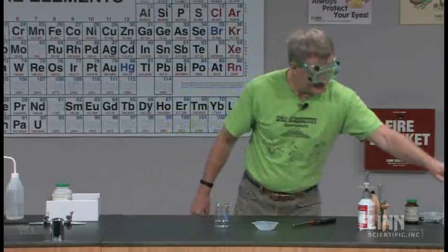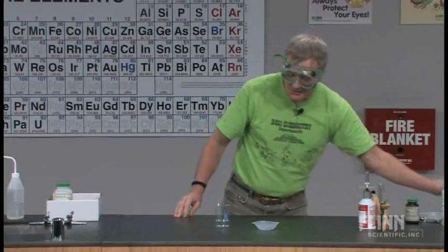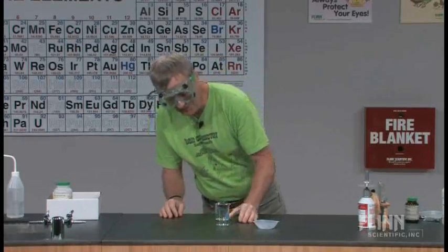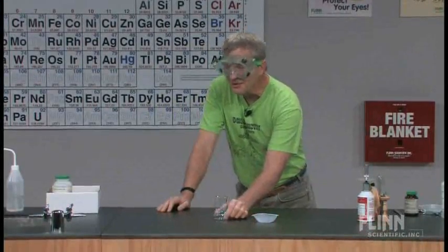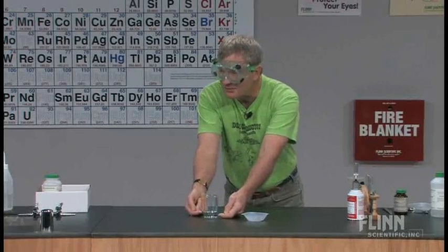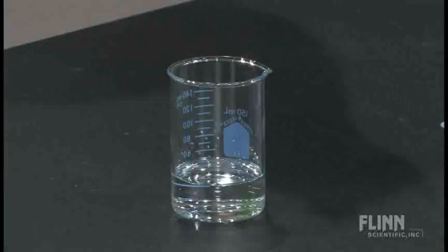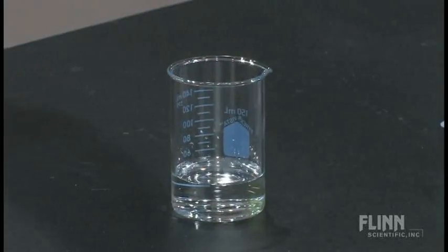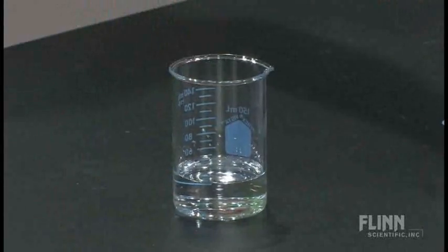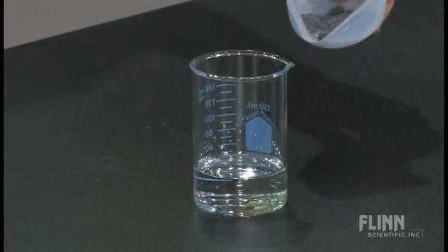All right, set that aside. Got it here. Again, we want to dim the lights a little bit on this one. Let me ask the guys, we're going to need a side shot here because we're going to see some bubbles when I drop this stuff in that are going to be formed when the product goes inside there. But we're also going to want to see it from the top later as the silane is generated. So are we in a good spot for that now?